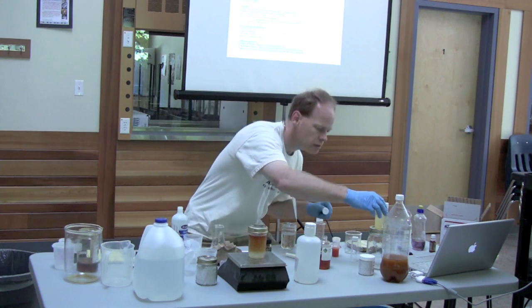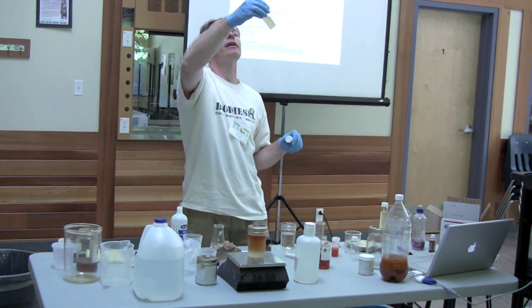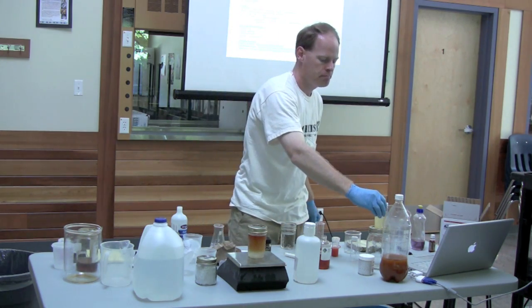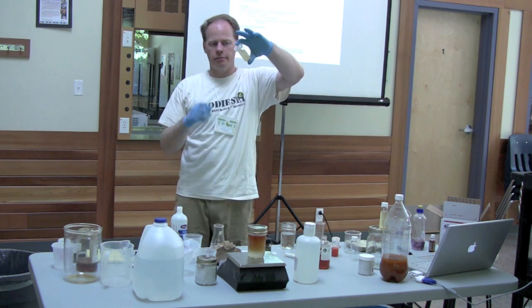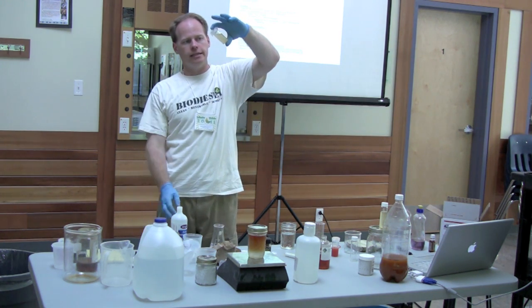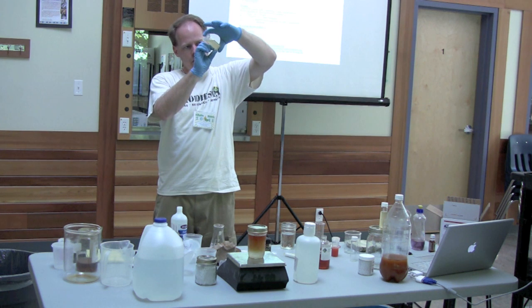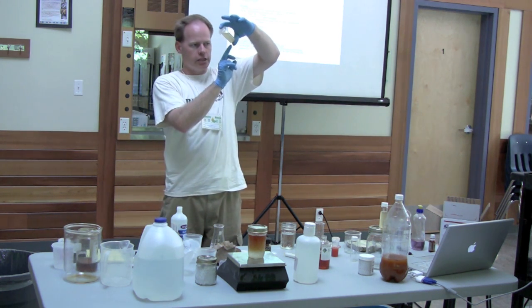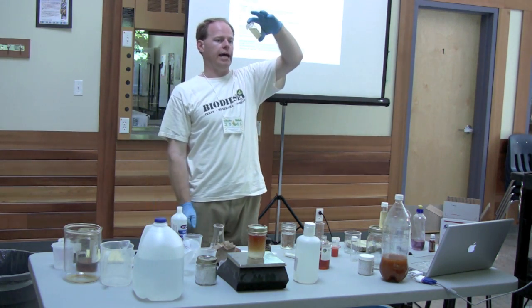And if you look real close at this 327, yes, I see pooling. Now granted, I kind of fouled this one because I threw a little bit of oil in the bottom there. My rule of thumb, and you'll see this on my website, is I turn it on its side and let it pool after it sat for 5 minutes. If there's over 1/4 of an inch of pooling in the bottom of this, I definitely am going to re-react my batch.